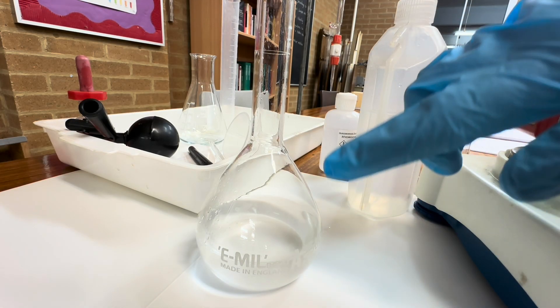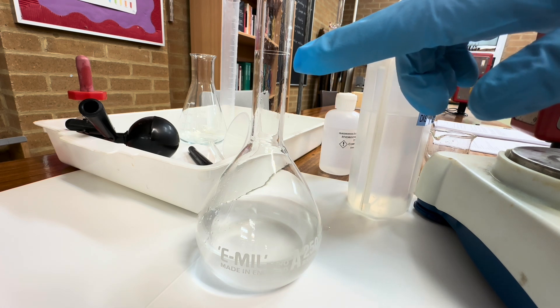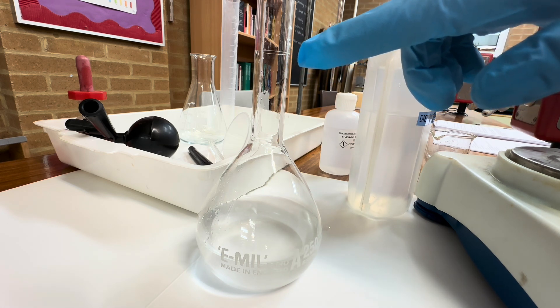Now the next thing we need to do is fill the volumetric flask so the bottom of the meniscus of the water is exactly equal to this marker here.